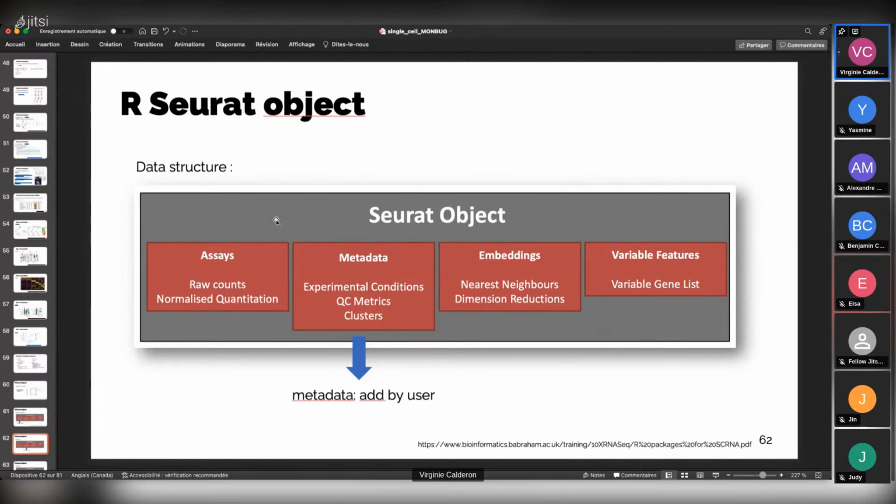So you can have maybe 3 or 4 experimental conditions, different metadata for the experimental condition. So maybe you have one annotation for the drug used, one annotation for the gender of the samples, maybe one annotation for the time of the sample. So you can have a lot of experimental conditions at this point.